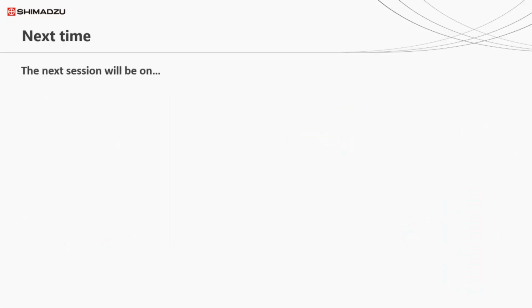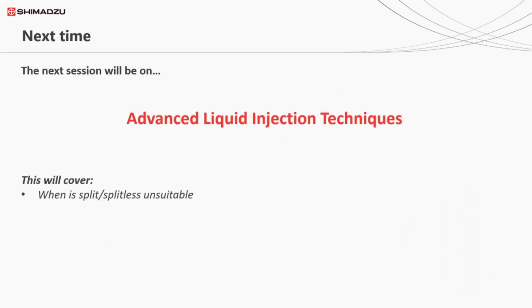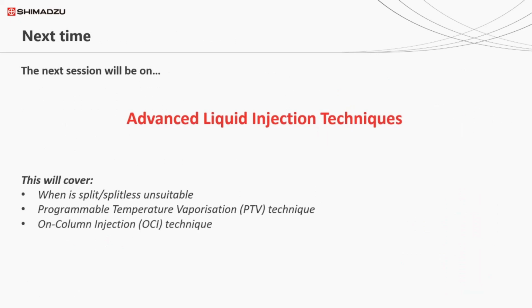On that subject, the next session will cover advanced liquid injection techniques. In this we'll be covering when splitless is unsuitable. We'll look at programmable temperature vaporization, on column injection, large volume injection, and multimode inlets.